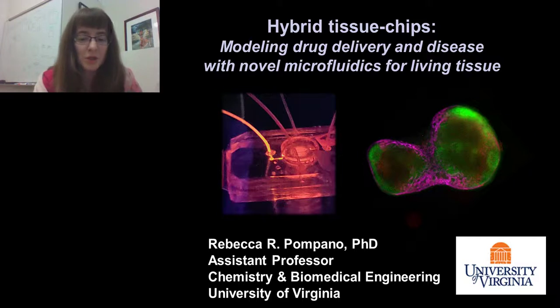And I'm going to be sharing with you today some new technology to combine the fluidic control of microfluidics with the power of intact live tissue samples.